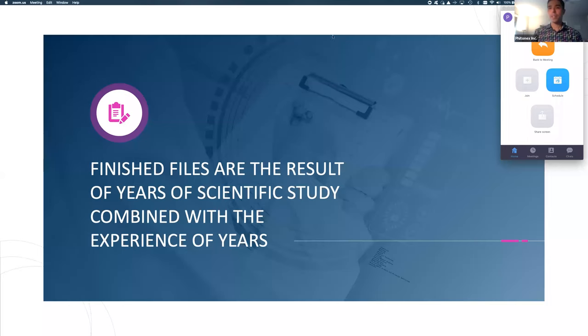All right, let's go ahead and get started because early is on time and on time is late. So let's start this out a little bit differently. We're thinking about panel design and fluorescence, and hopefully everyone can hear me. Otherwise, just give me a chat here.